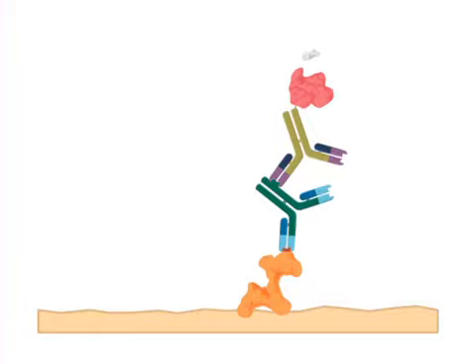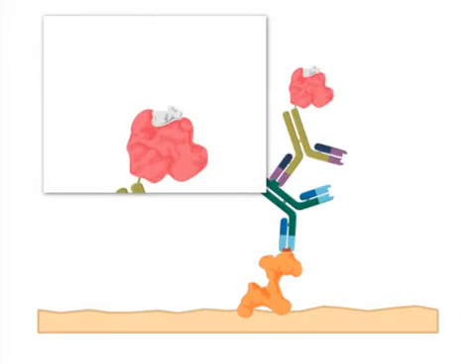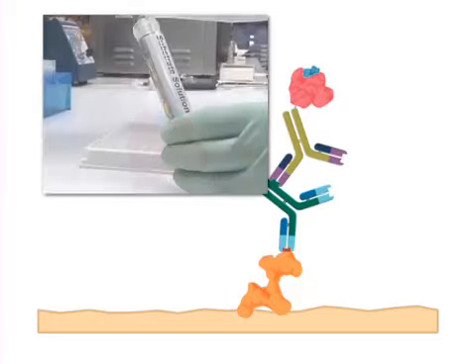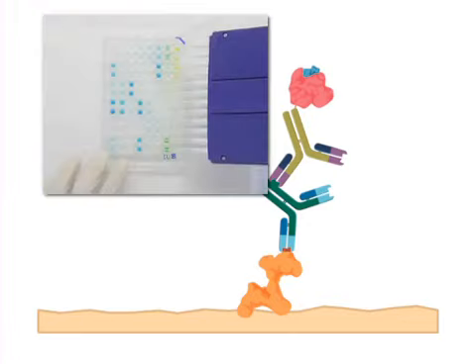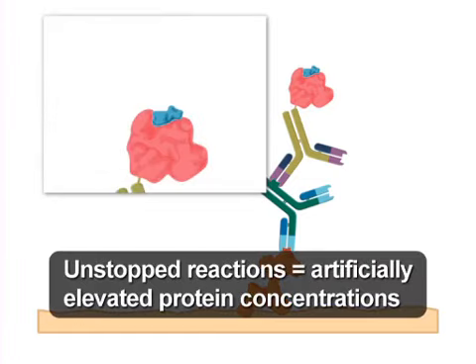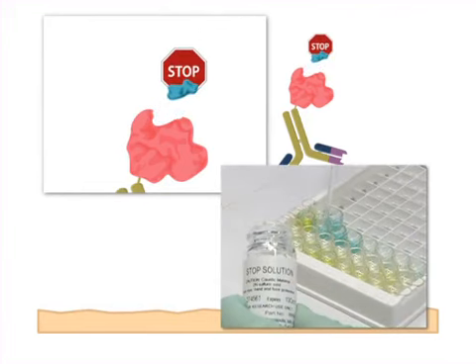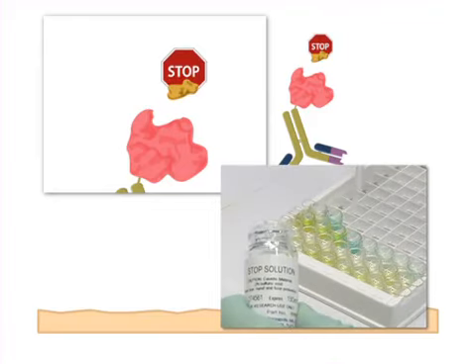A substrate, which binds to the active site of the enzyme linked to the secondary antibody, will also be needed. The chemical reaction that occurs during this reaction causes a color change in the otherwise colorless substrate. This so-called colorimetric assay allows the identification and quantification of the presence of the target protein. The enzymatic reaction will continue as long as there is available substrate. Therefore, after a brief incubation period, a stop solution, which causes yet another color change to indicate the reaction has in fact been halted, is added to the wells.